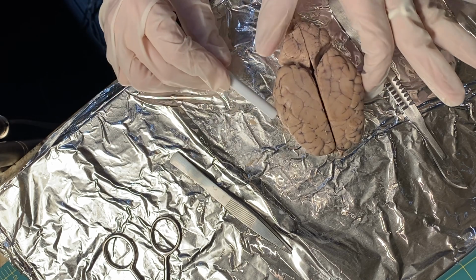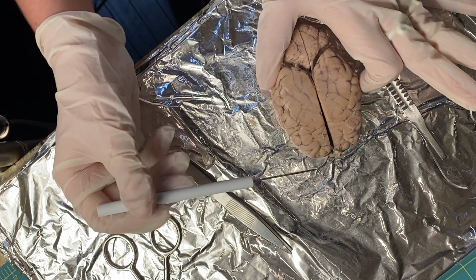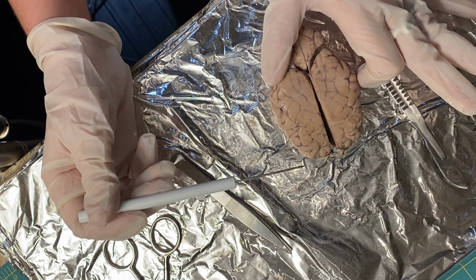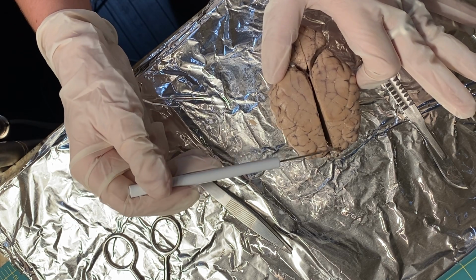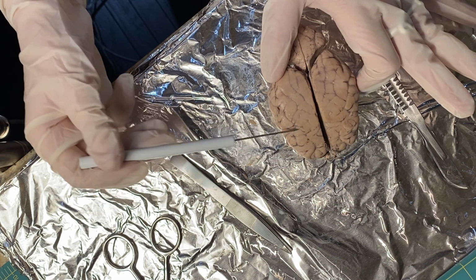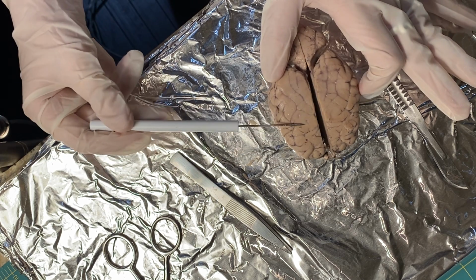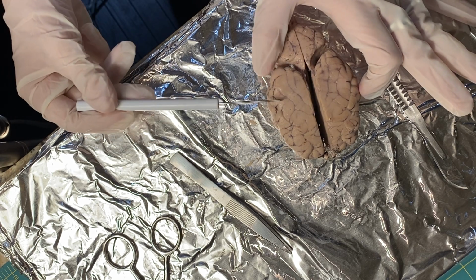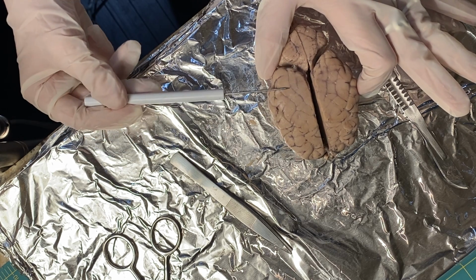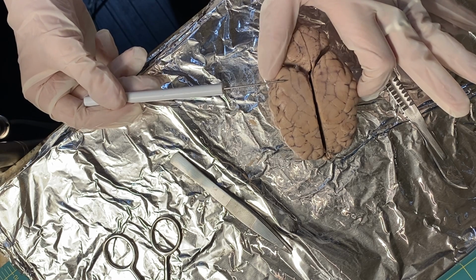So there are 4 lobes. We've got the frontal lobe, which controls motor functioning. We've got the parietal lobe, which receives and processes somatic sensory information. And we've got the occipital lobe, which is primarily responsible for vision.